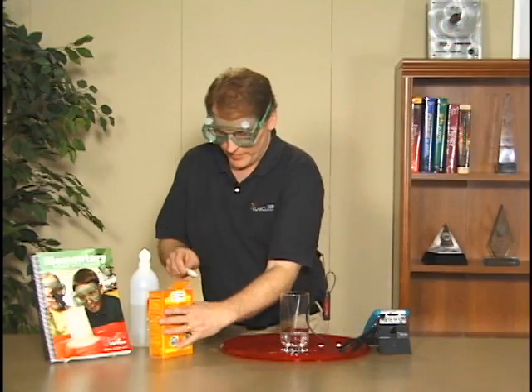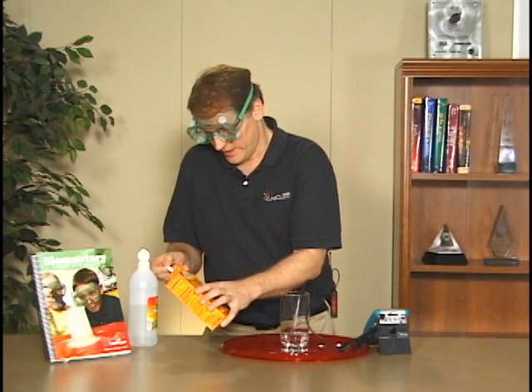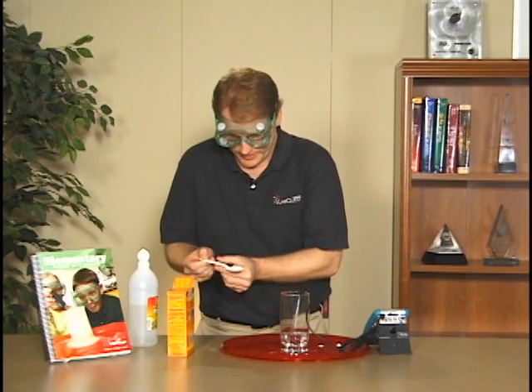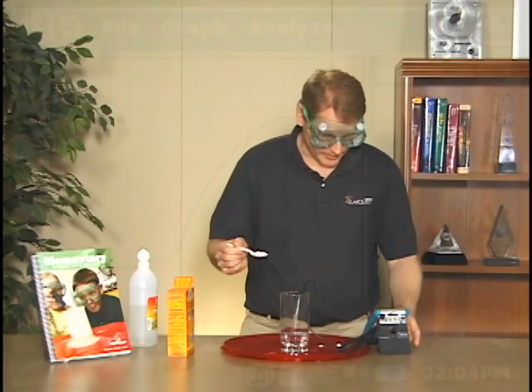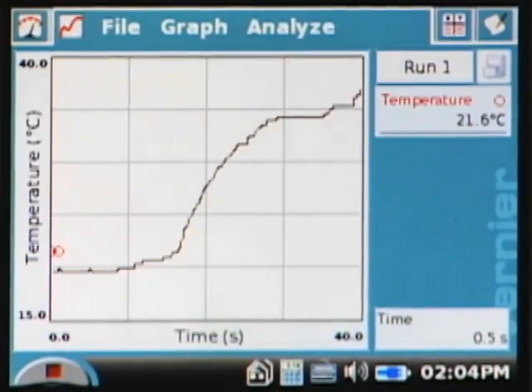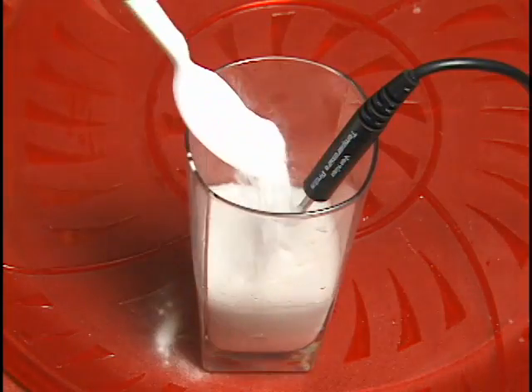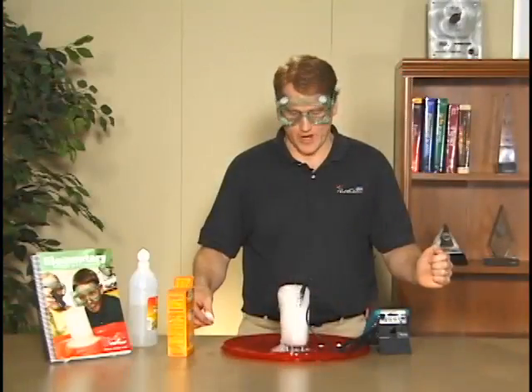Now I'm ready to begin the collection. Let me get some baking soda. The lab calls for a level teaspoon—that's close to being level there. I start the collection and it starts collecting: 3 seconds, 4, 5, and you see now why I have the tray.